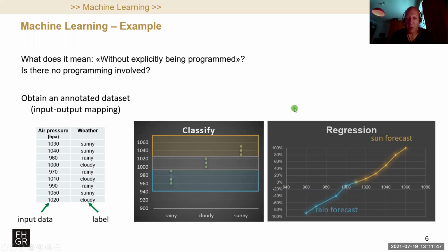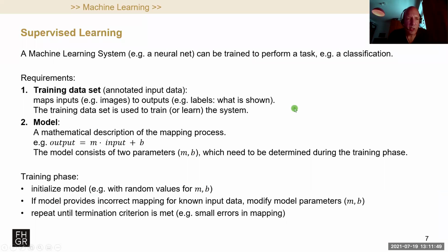So this is machine learning in a nutshell. For us, with the image analysis task, we're going to have, of course, a training data set, which is consisting of a lot of images typically. And then we would want to train a model using that training data set.